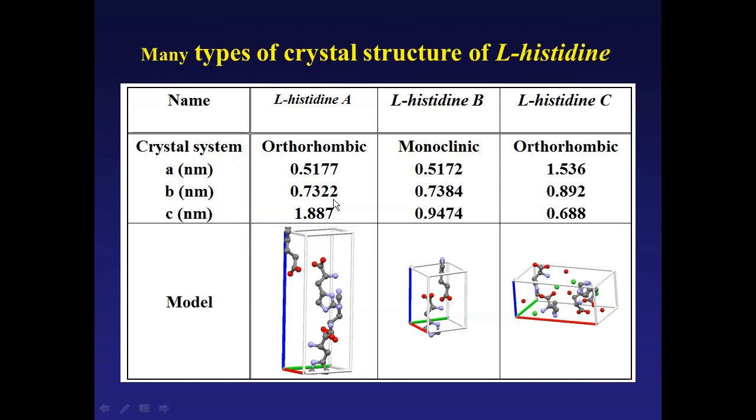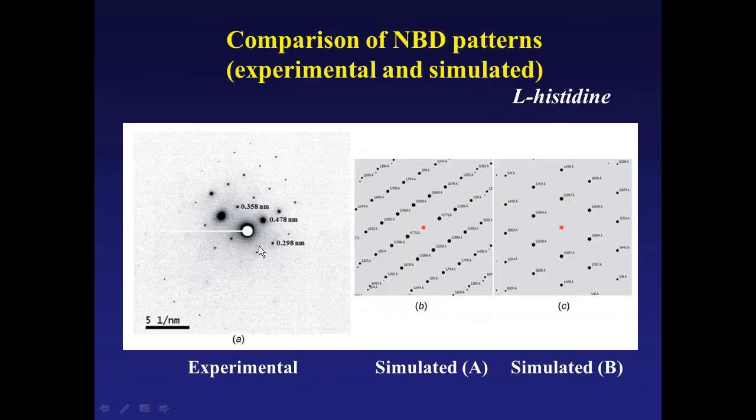the d-spacing with the electron diffraction pattern. Then we can identify it by comparing the A-type model and B-type model diffraction, measuring the intensity here. This measured one is in good agreement with the A-type model. So we can understand this L-histidine crystal was the A-type pattern, not the B-type like this. So owing to the electron diffraction pattern analysis, we can identify the crystal structure like this.